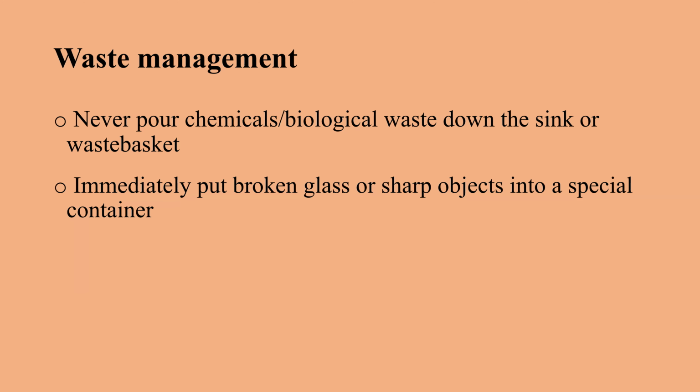Another very important question is waste management, because different types of waste should be sorted and not mixed. Each waste has its own protocol.